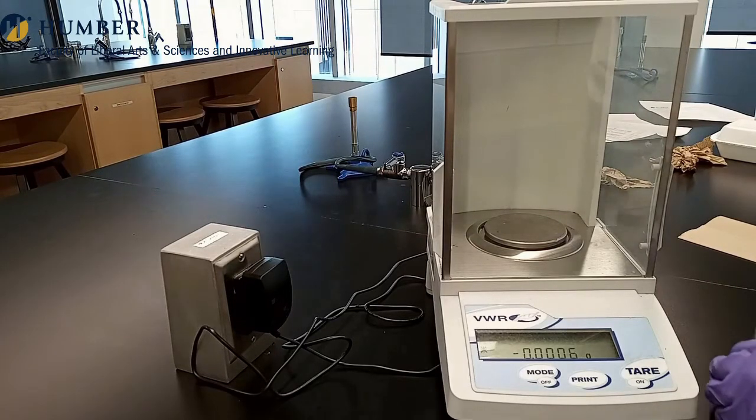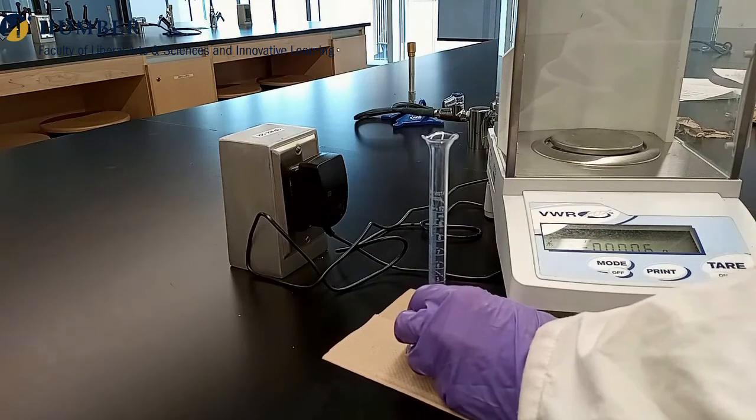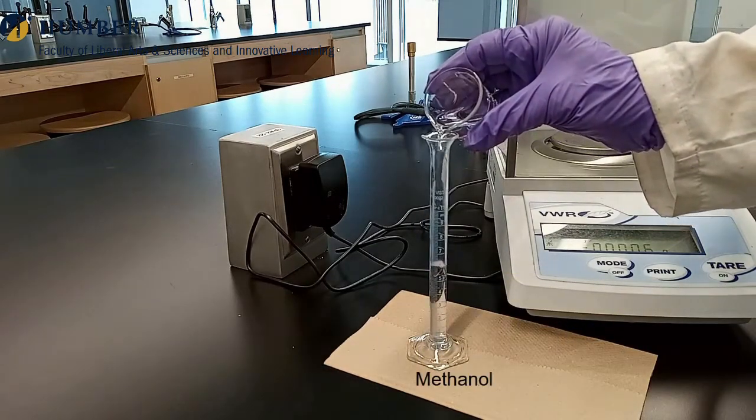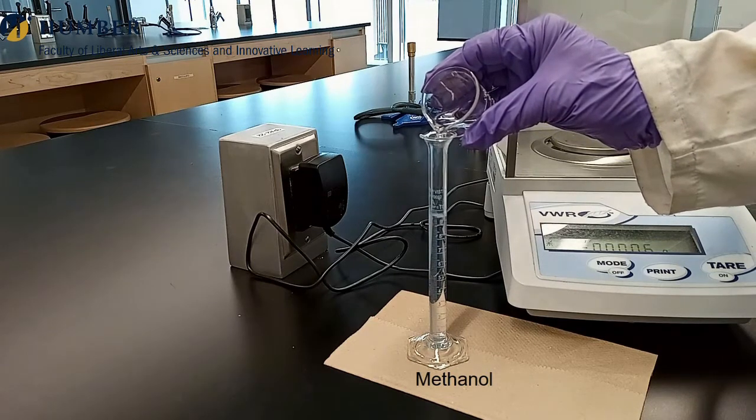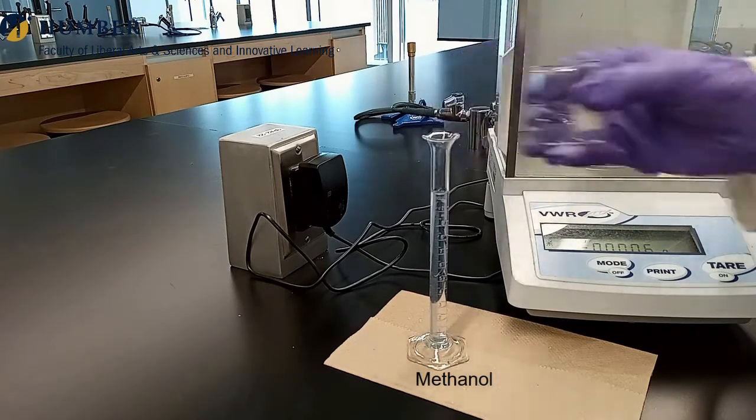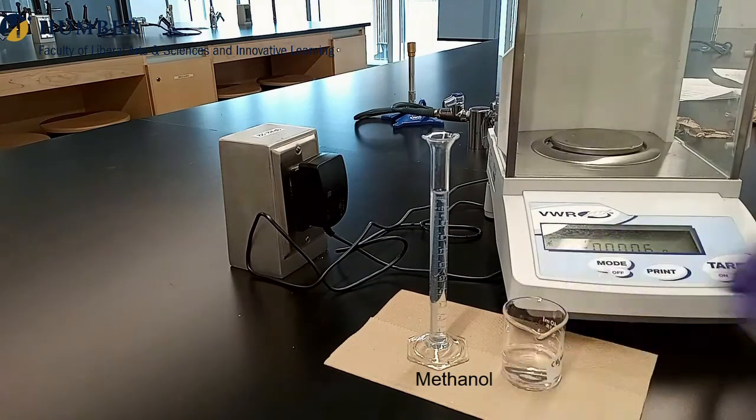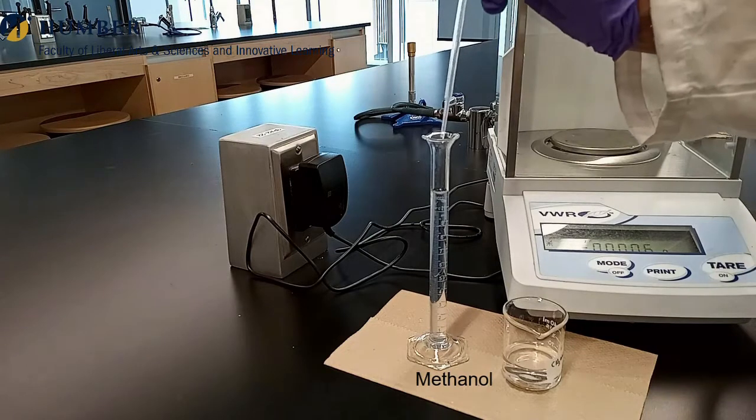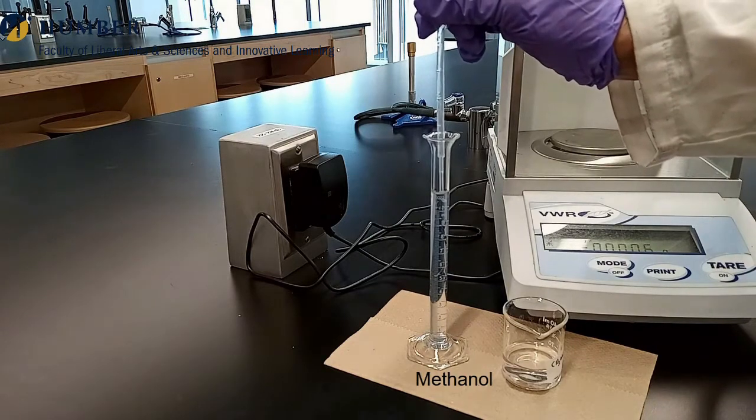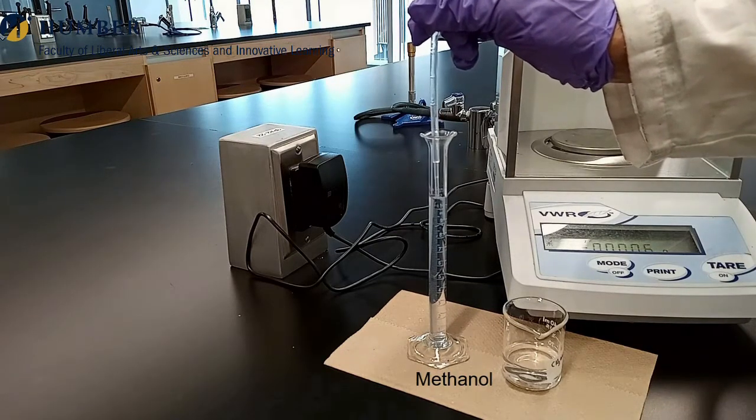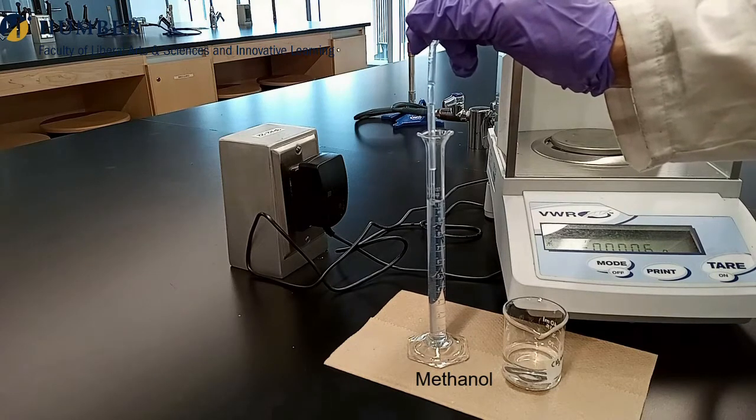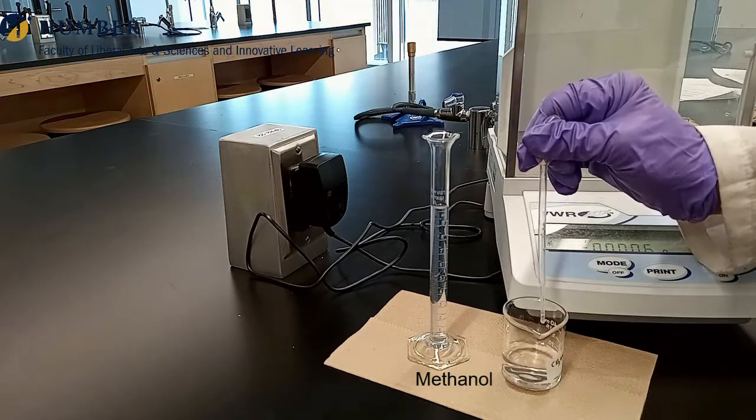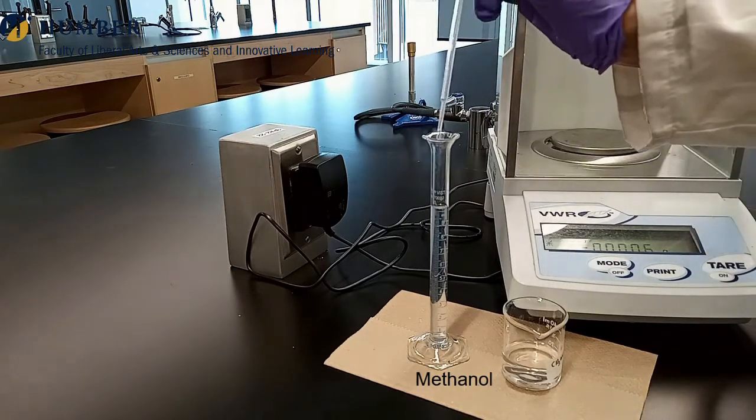Fill the measuring cylinder exactly to the 10 ml mark with sample A. Record this mass as m2 for sample A in the data table.